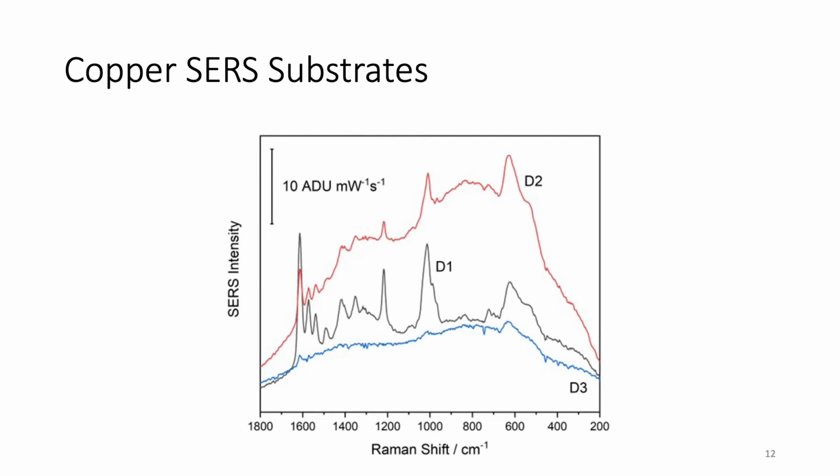I wanted to see how long it would take for the copper to oxidize on my PVD-coated copper screen-printed electrodes. I did this analysis through SERS. First, I deposited a copper screen-printed electrode, and then I deposited my PYOT as my analyte. I next performed SERS, and I did so for an electrode that was 2 and 3 days old. As you can see, the enhancement decreased after 1 day, which leads me to say that the copper-coated screen-printed electrodes can only be used for 1 day when performing SERS.